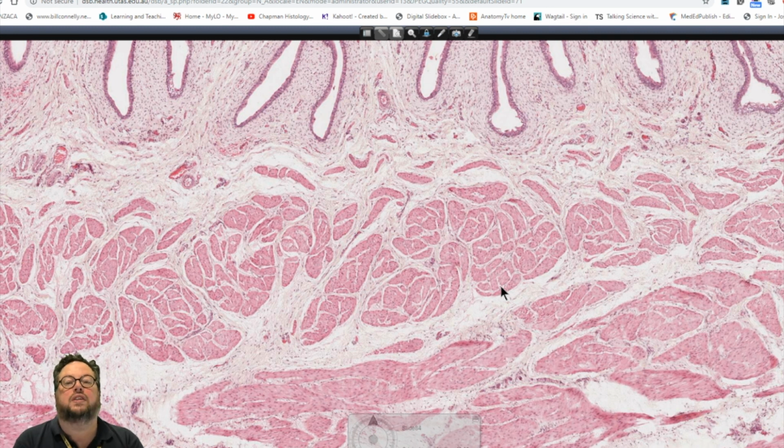There are more in pockets, and it's because it's not so much a coordinated relaxation, peristaltic type of contraction. Of course, when we get the stimulus from the parasympathetic nervous system to void the bladder, then we get this massive contraction to reduce the volume and force urine out through the urethra there.